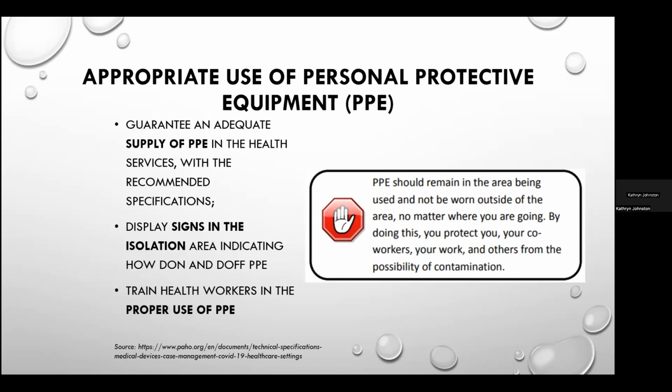And then it's important that healthcare workers are trained and understand that those PPEs act as a barrier between them and the infectious substance. It helps delay the transfer. I went through all these before, and it protects their clothing. But it relies on the healthcare worker using the PPEs as they're designed and using them properly as they're trained. So there should be some type of monitoring going on in the process of using PPEs to ensure that your healthcare workers are using them properly.